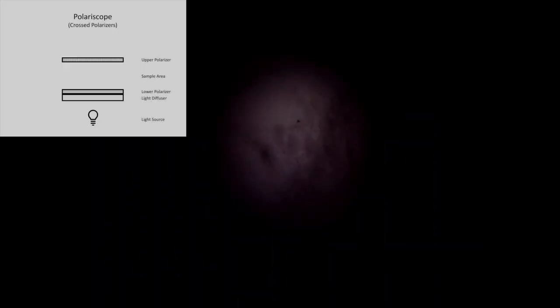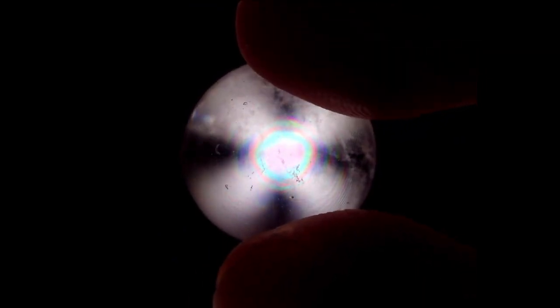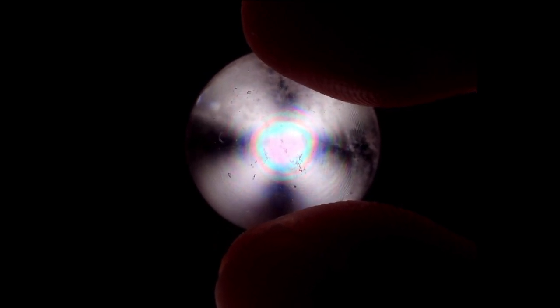Let's bring in our upper polarizer and take a look at our sample with crossed polarizers. As the upper polarizer comes into view, you can see the quartz sphere is currently transmitting light. With enough reorienting of our quartz sphere, we can eventually get it to the point where we see a nice quartz uniaxial optic axis interference figure. With quartz, we have the special bonus property of optical activity, and so we end up with a pink circle erasing the center of our uniaxial optic axis interference figure. Here's the quartz sphere figure compared with the corundum sphere figure. If you want to learn more about the optical activity of quartz caused by those helical chains of silica tetrahedra spiraling parallel to the C crystallographic axis, check out the Snellius Minerals Quartz Slice video.